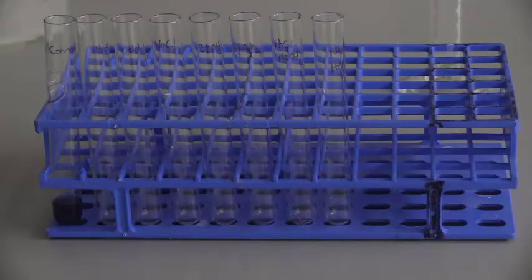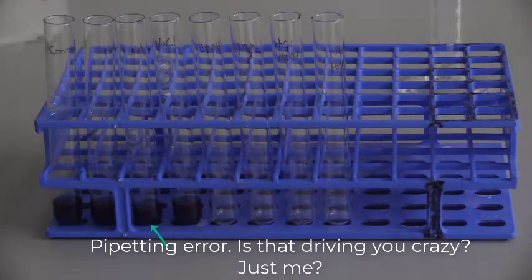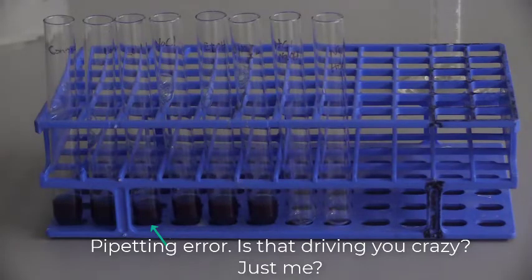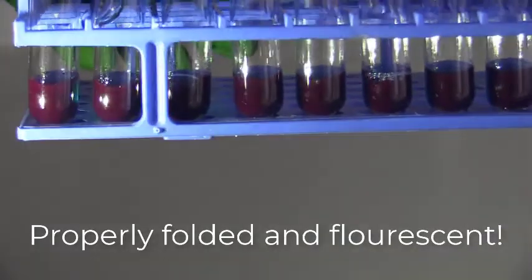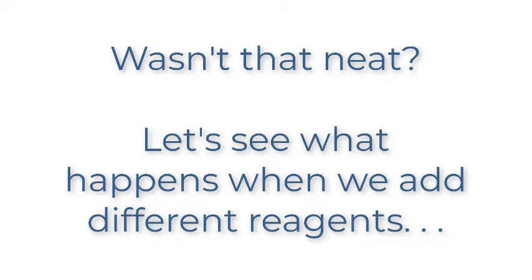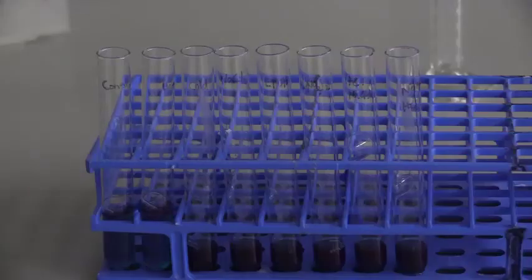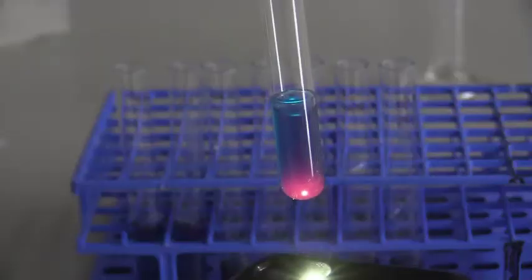Okay, so I'm getting the tubes ready, and each tube gets 1 ml of the protein, and we have 8 samples. There's a control, a hot sample, a cold sample, sodium chloride, ethanol, lead nitrate, acid, and base. Dilute the first 3 samples with phosphate buffer. You can make the observations there.